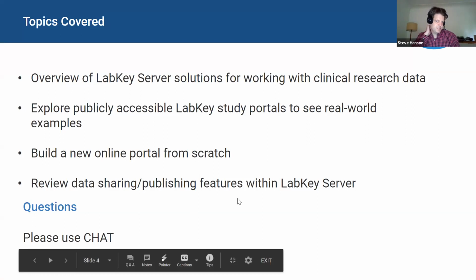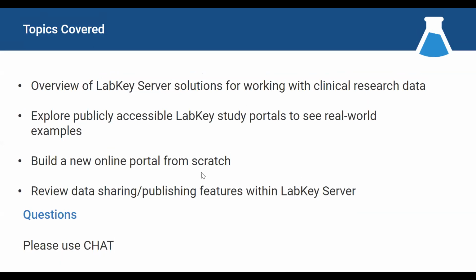Great, thank you so much, Jason. I'm going to turn off my video just so it's a little less distracting. All right, well, as Jason said, we're going to do a mix of feature overviews today and also real world building of something out.